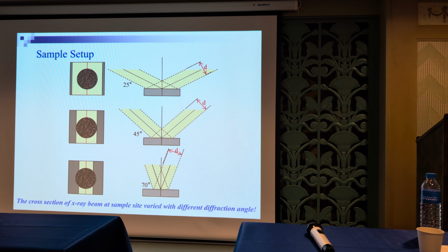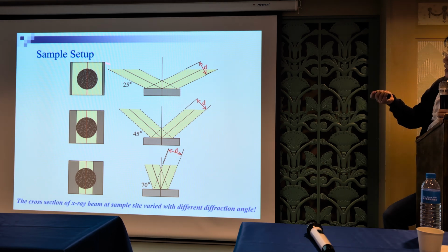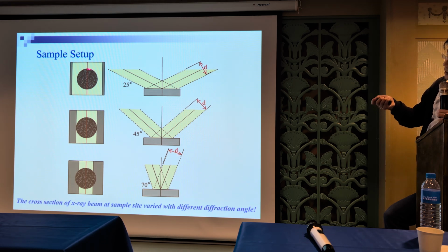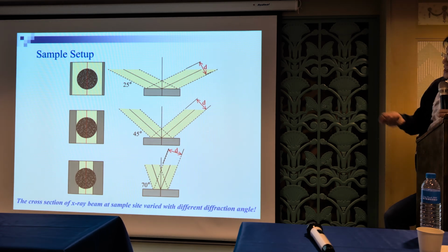Okay, so here is the effect that I just talked about. Sometimes for the in-house X-ray, we have the configuration like this. So we have the two theta here, and we shine X-ray to the sample stage, and we move this 2 theta from here to here. If you spread the sample like this, that's the typical way I found many students do it.